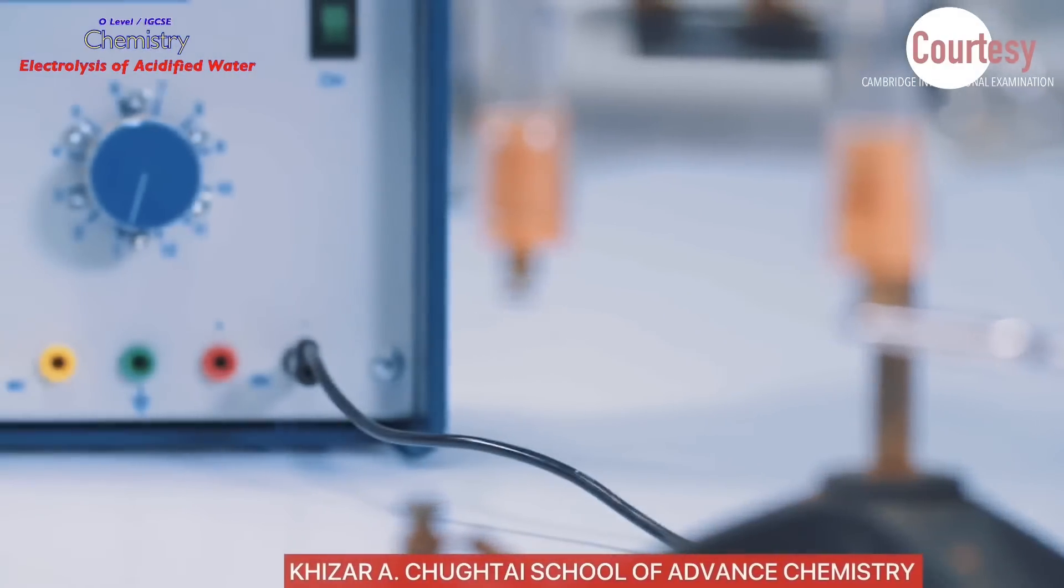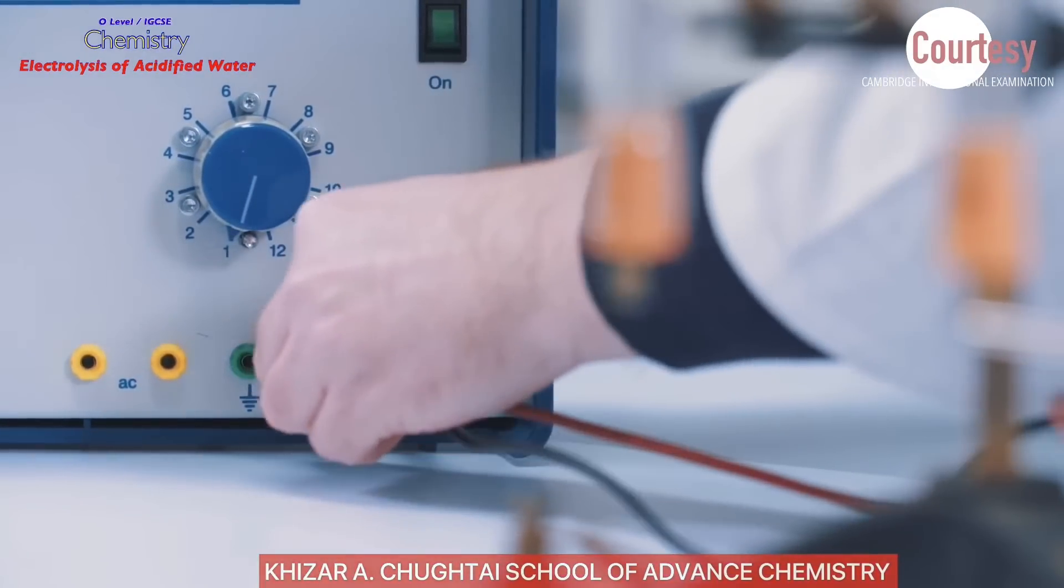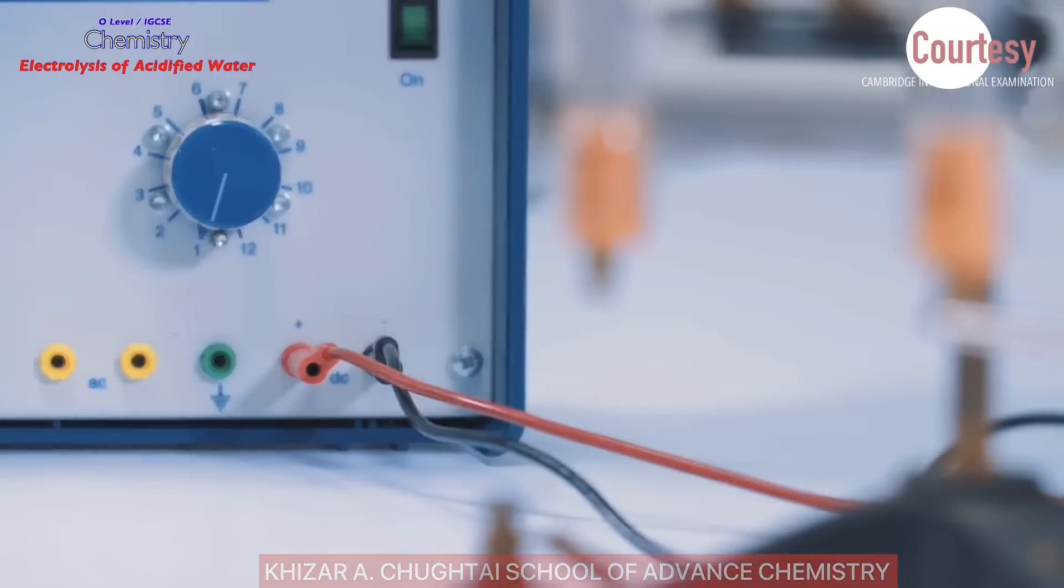Red cable is connected to the positive terminal of the power supply and that to the other platinum electrode. This is the anode.